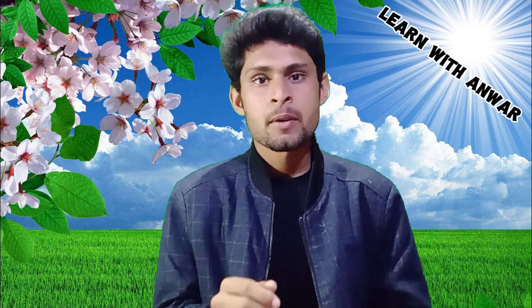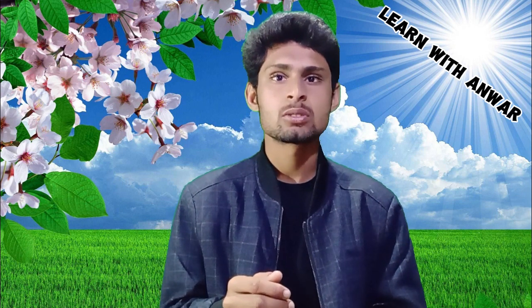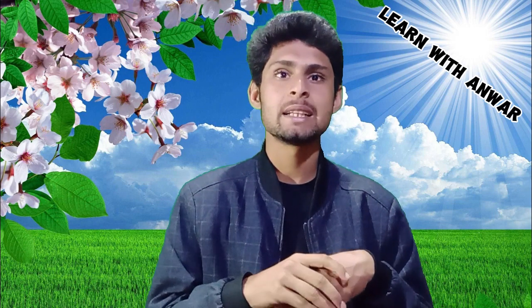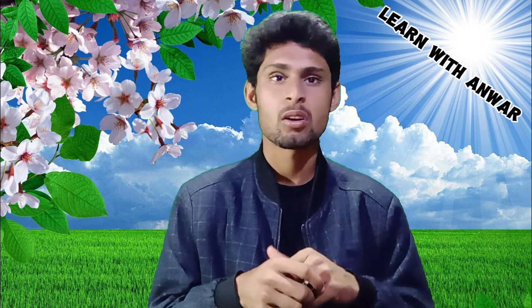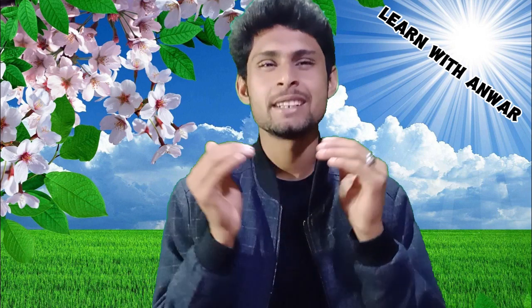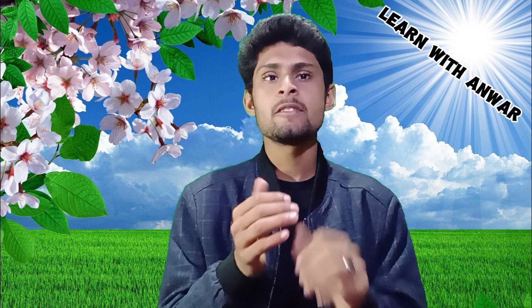Then we discussed the principle of the microscope. The simple microscope consists of a single lens, traditionally called a loupe. The most familiar present-day example is the reading or magnifying glass. Present-day higher-magnification lenses are often made with two glass elements that produce a color-corrected image, and can be worn around the neck, packaged in a cylindrical form that can be held immediately in front of the eyes.